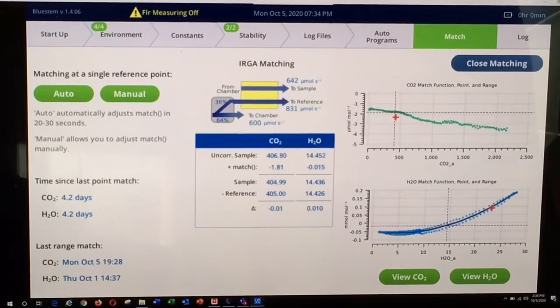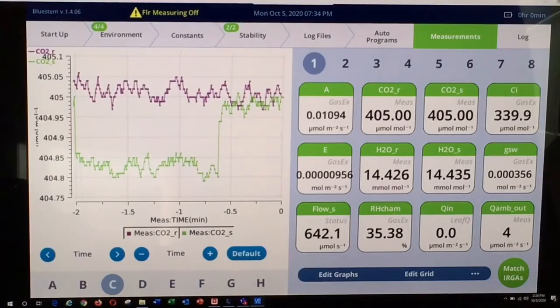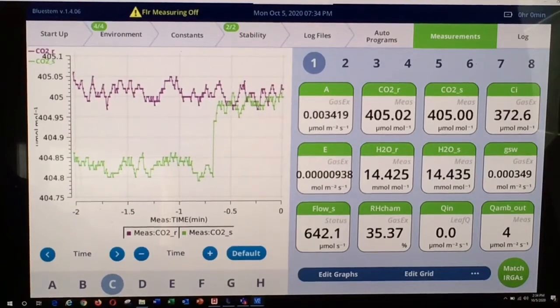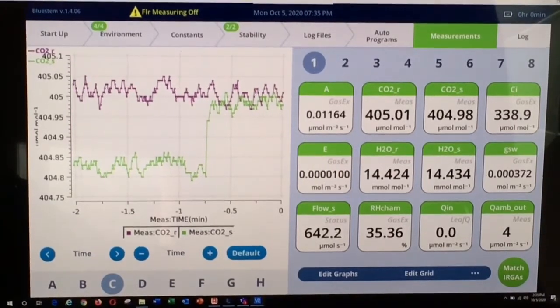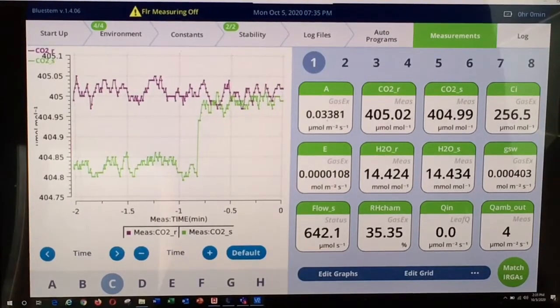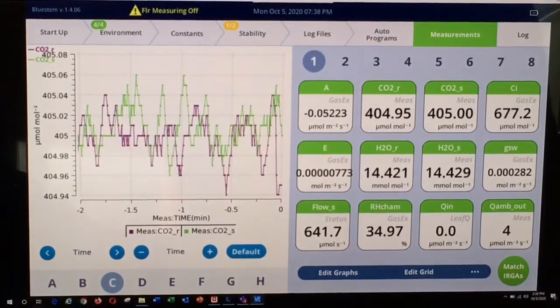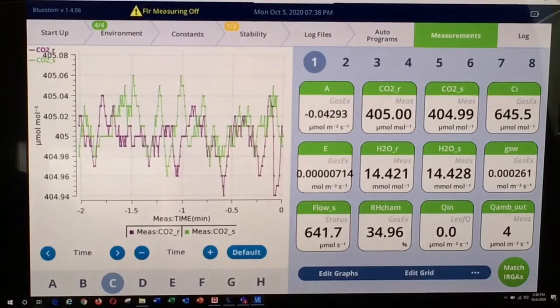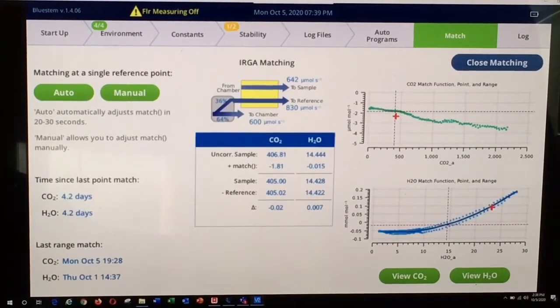We'll select Exit CO2, and then close the matching function using the top right portion of the screen. As you can see, the reference and sample CO2 mole fractions are now well matched, with the expected assimilation value right around 0. Now that CO2 is matched, we will go back to the match screen and highlight the other option available for range matching — the water vapor range matching option. We'll select View H2O.